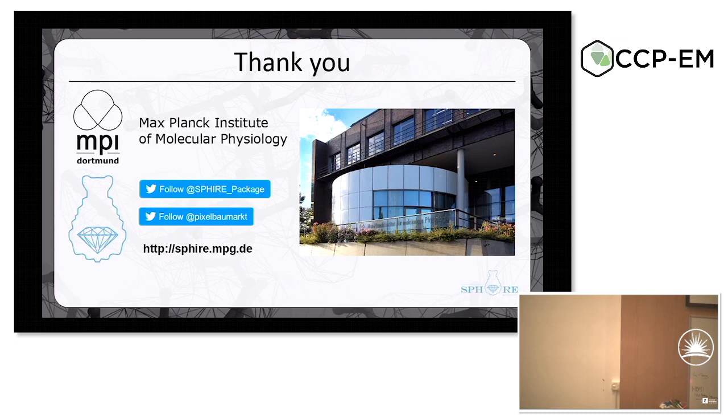You mentioned that you'd recommend training the algorithm on multiple data collections from the same protein. If you had a protein that shows different conformations, or you have mutant forms of the protein that show slightly different conformations, would the algorithm trained on one conformation of the protein be likely to pick up a different conformation? How malleable is it to slightly different conformations of the same protein?